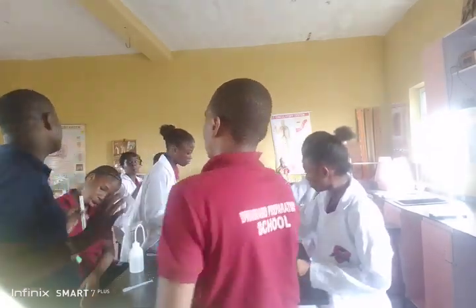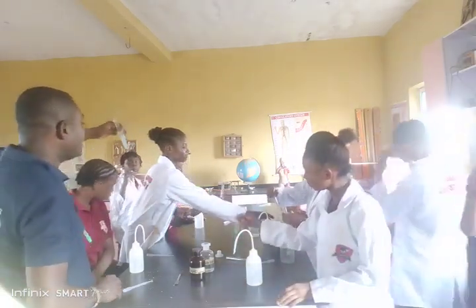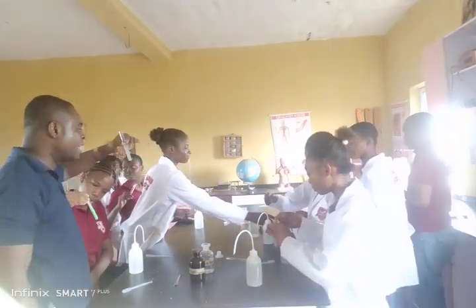You can see now we have tested for copper 2 ion, right? Yes. Second portion now, you want to test for chloride ion.